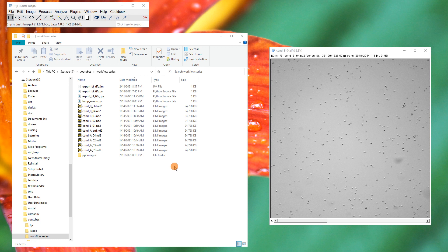This is part 1B of the workflow series. Part 1A is just the macro discussing how it works. You can download the ImageJ macro or the Python macro from the description or from that video, and move on to part 2 if you want to skip this part. This is going to be slightly slower and more involved — how I would make a macro from scratch, the thought process, and how I get to the functions I need.